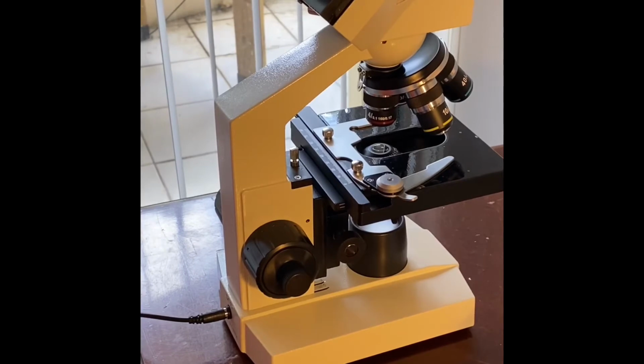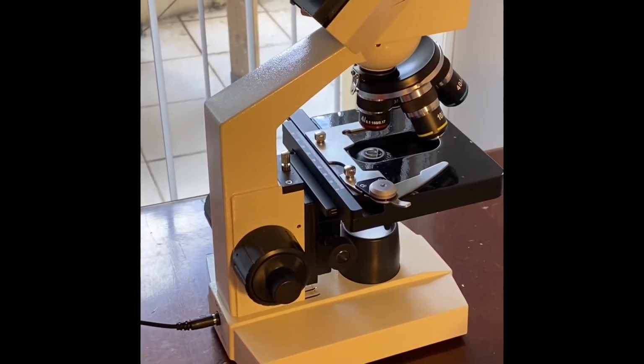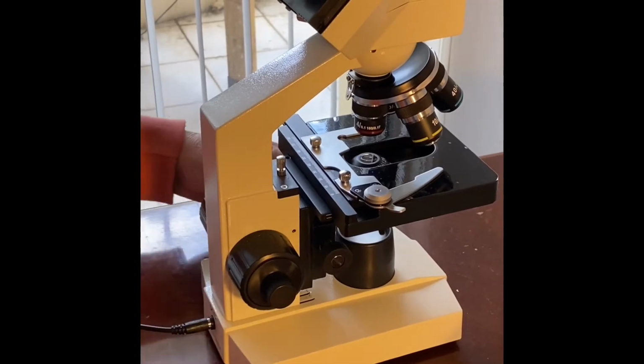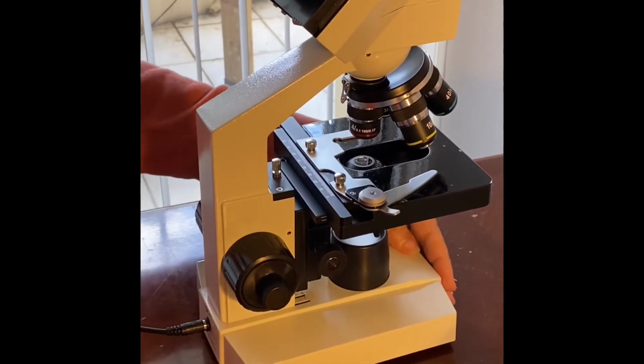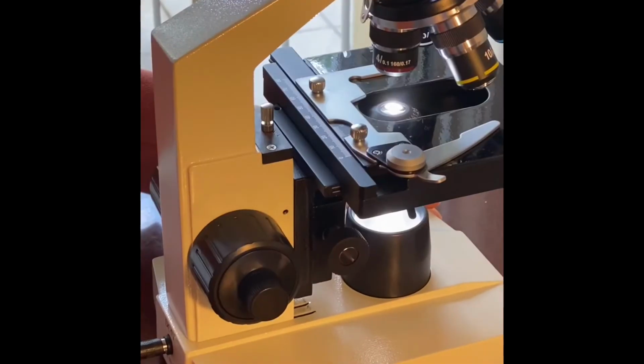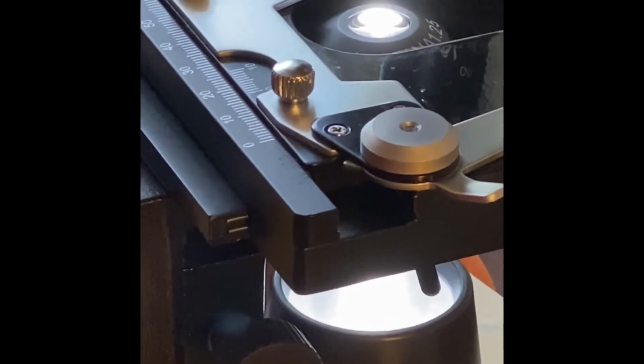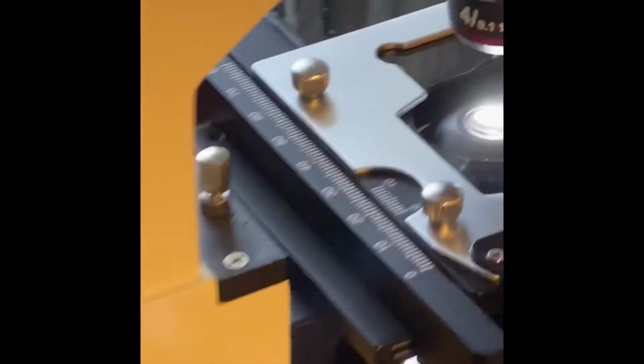Another key feature to your microscopes is the light. There's a switch, and that turns on the light. My switch is here behind the coarse adjustment.